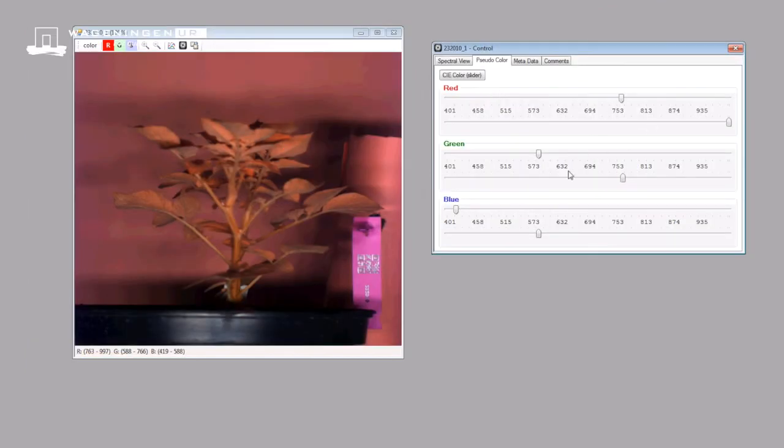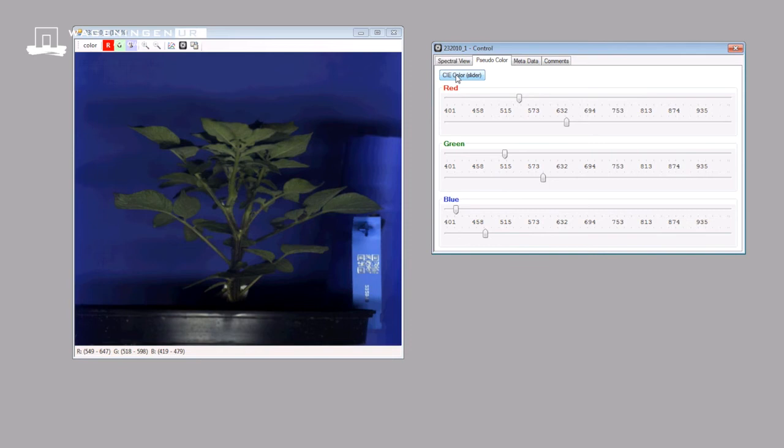A pseudo-color image can be displayed by mapping parts of the wavelength range to the red, green, and blue channels. This way, spectral differences can be visually enhanced.